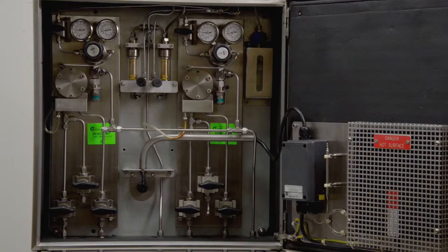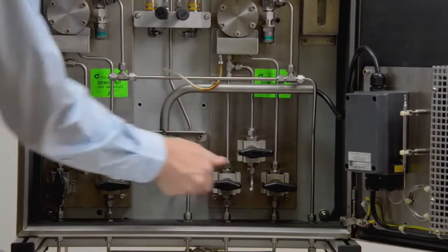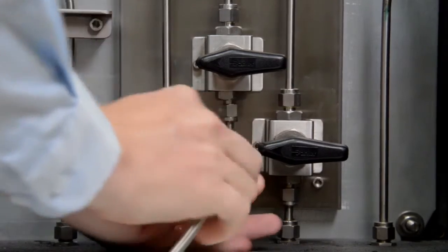A pressurized cleaning fluid can be attached to the fast sample loop. Close the stream valve, attach the tubing of the cleaning fluid, and open the cleaning valve.